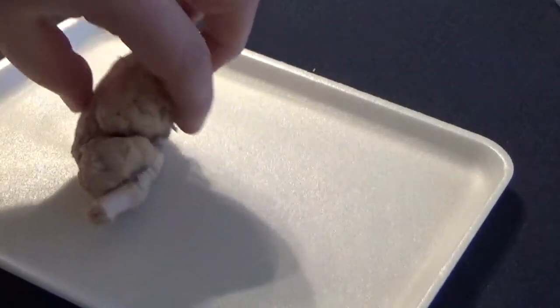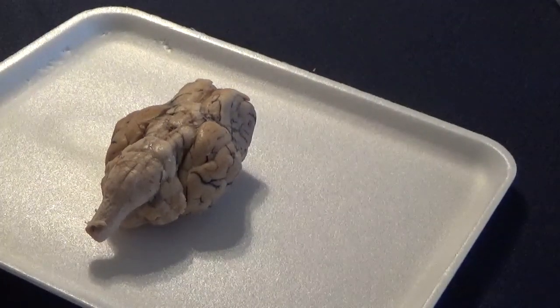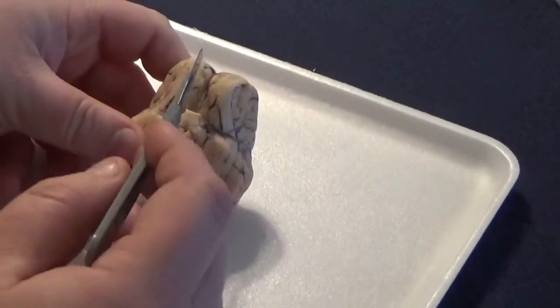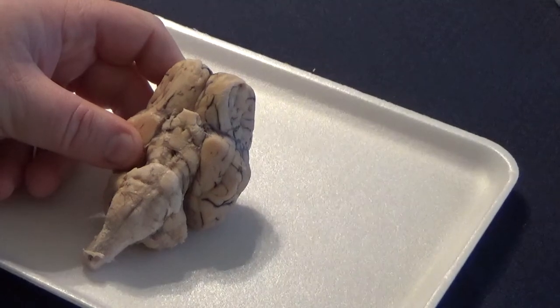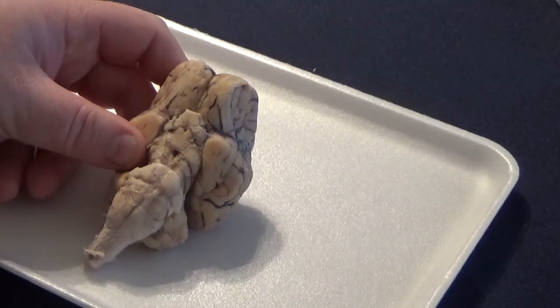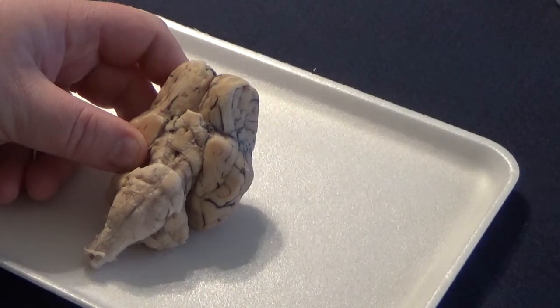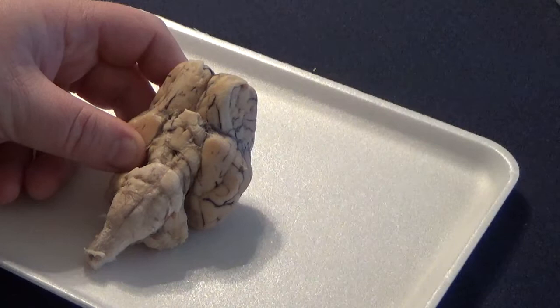So if we flip this brain around and look at the back side, we can identify some other features. On the back side, we can see the olfactory bulbs. Here are the olfactory bulbs. A sheep's sense of smell is much more powerful than that of a human. Sheep use their sense of smell more than they use their sense of sight. So they have very large olfactory bulbs, much bigger than ours.